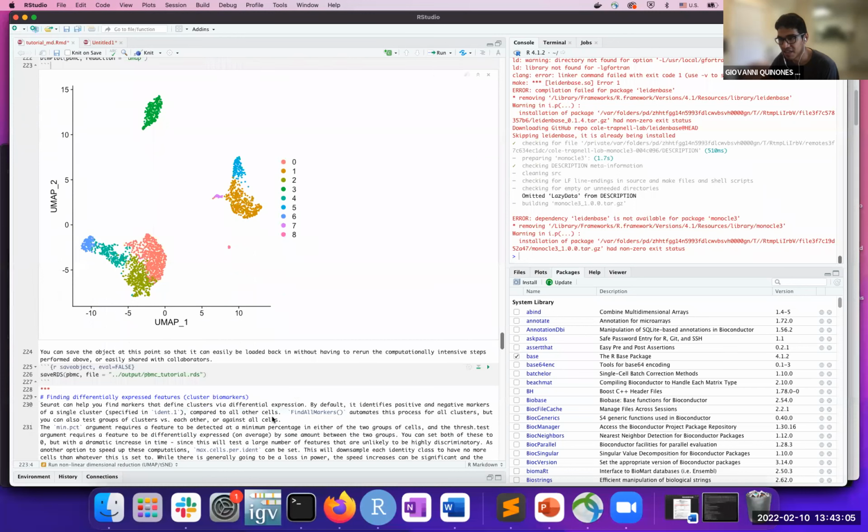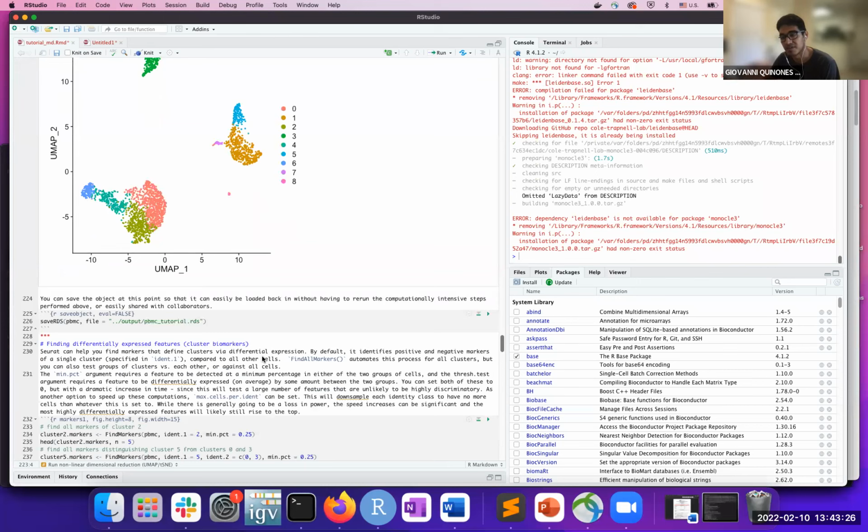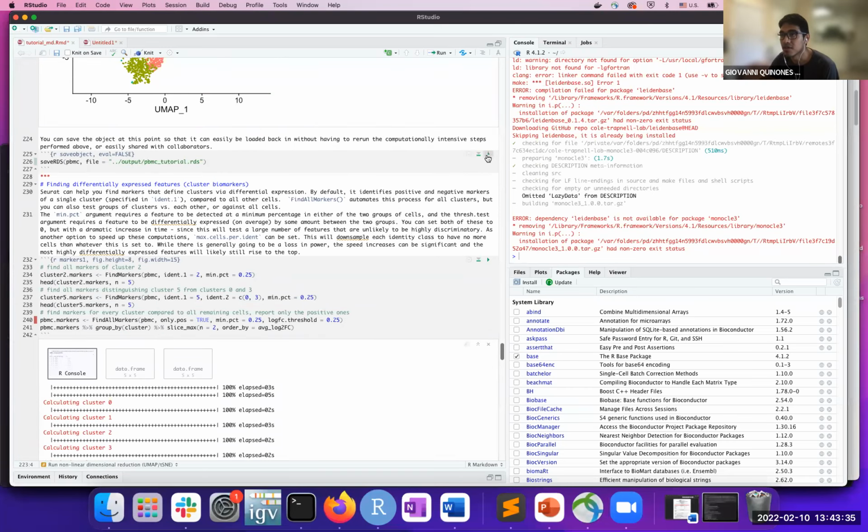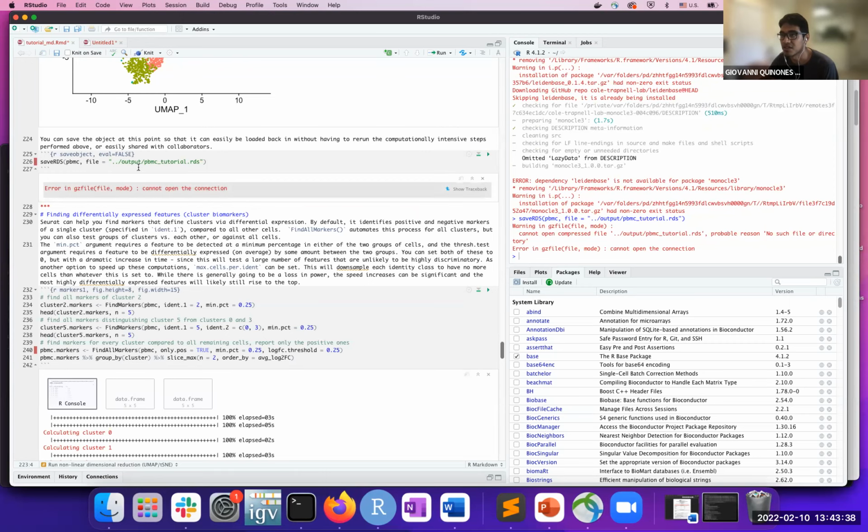Anyway, moving on, the next cell in our code is this function called saveRDS. This is not part of the analysis. It's just to save your progress, kind of. So next time you can pick up from this point. You don't need to run everything else. Oh yeah, so you'll need to change this path also. You'll need to change the path to the directory where you want to save this object.